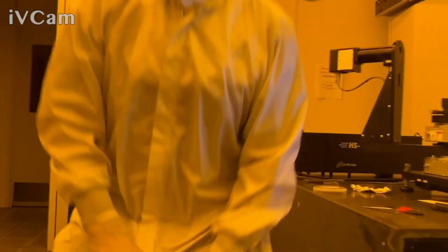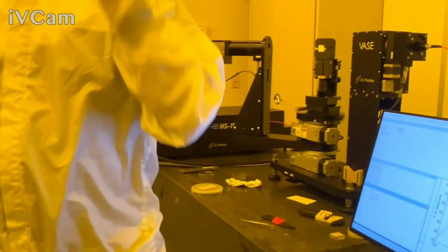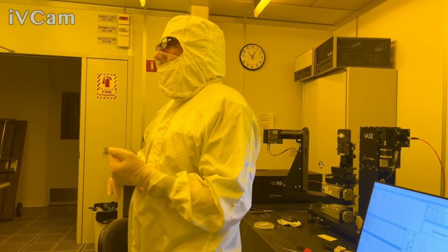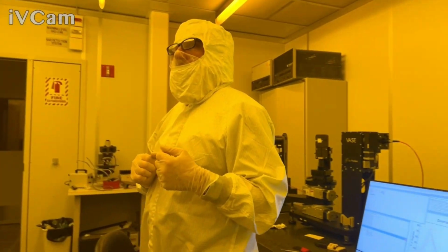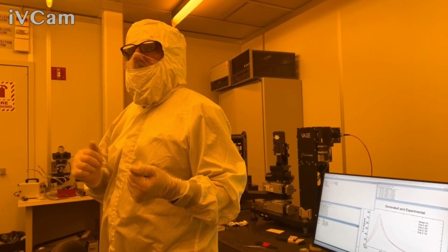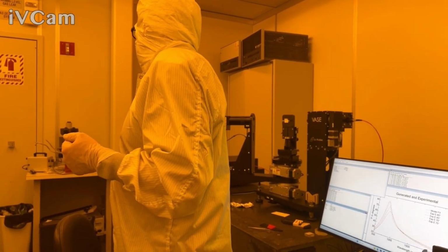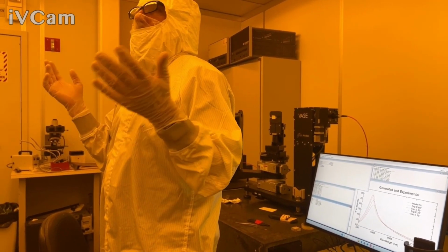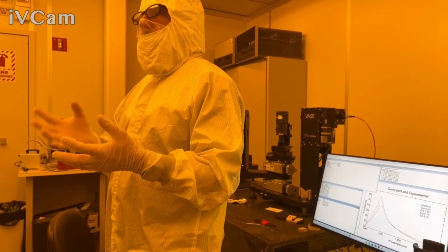Okay. The other thing is about maintenance. What are the different things we should think about? Sure. The consumables, the lamp. Really, it's a pretty low maintenance instrument. We've had these in the field for a really long time. There's not much preventative maintenance that I can think of. Over time, the reflector mirror in there, which lasts many years, sometimes people will get replaced.